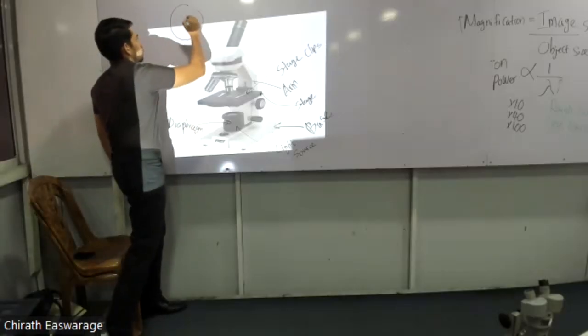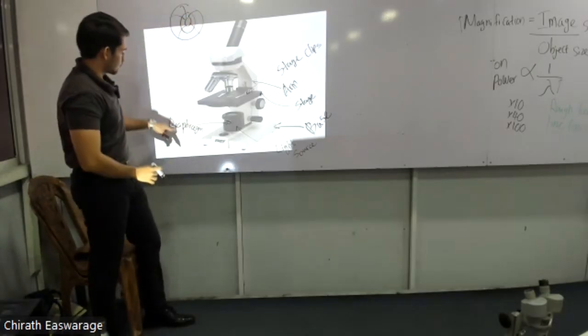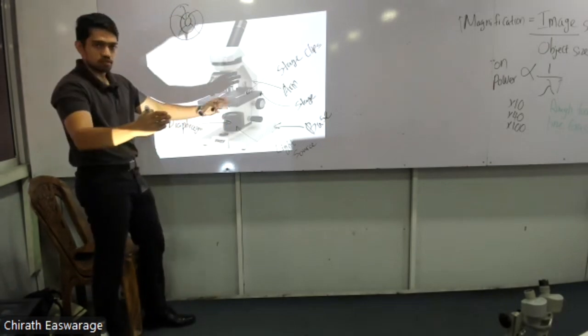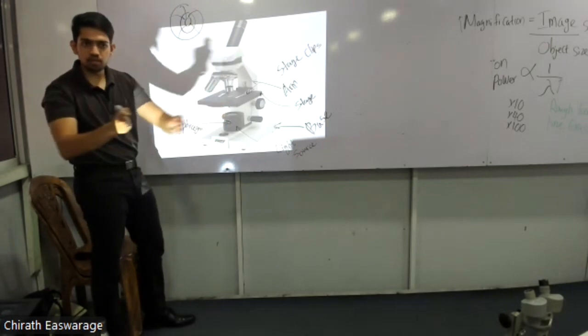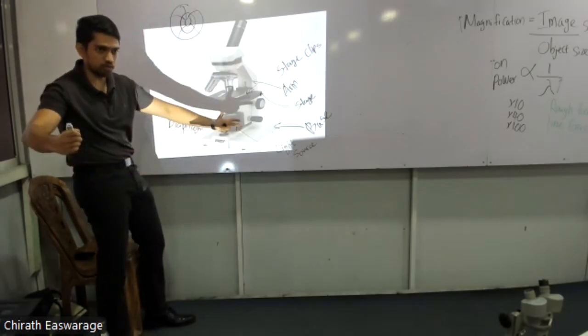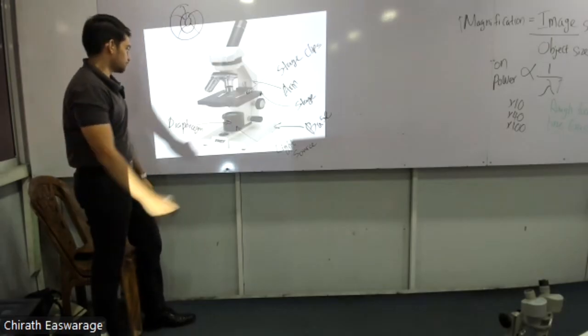It's an opening that can be made bigger and smaller, like in photos, it opens and closes. The diaphragm you can control. So you can control how big the circle of light coming from the bulb is. You can make it very big, or very pointy and sharp, using the diaphragm.